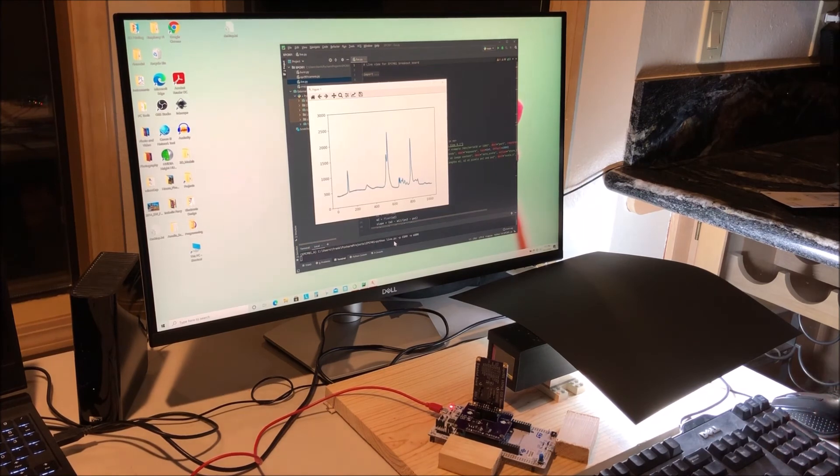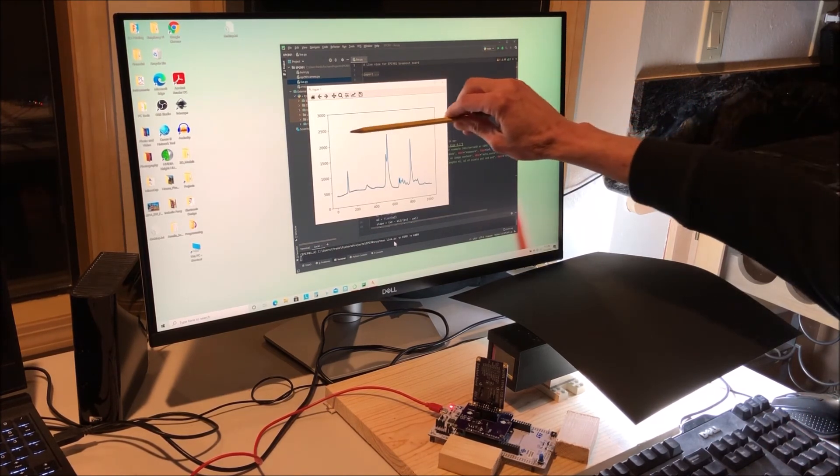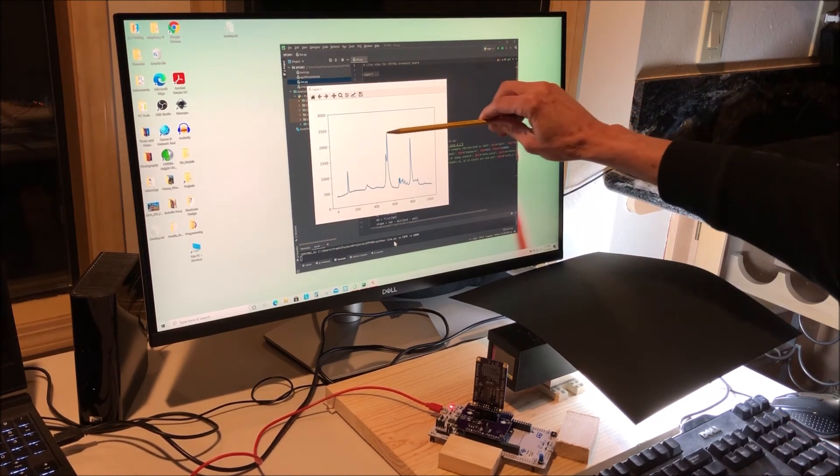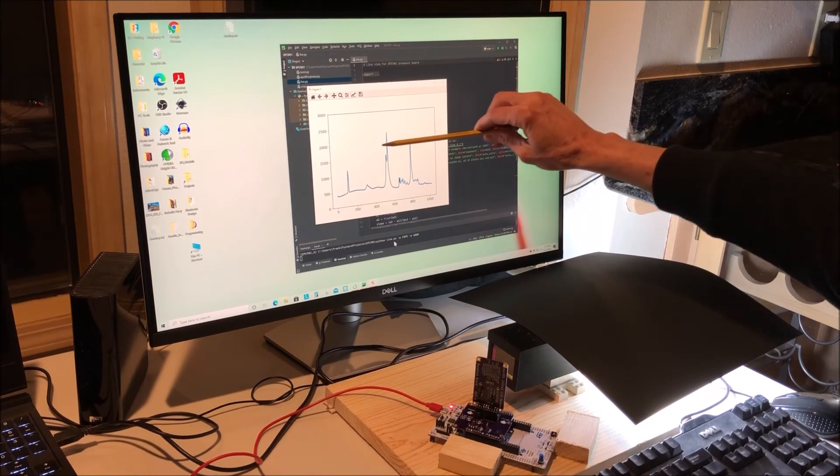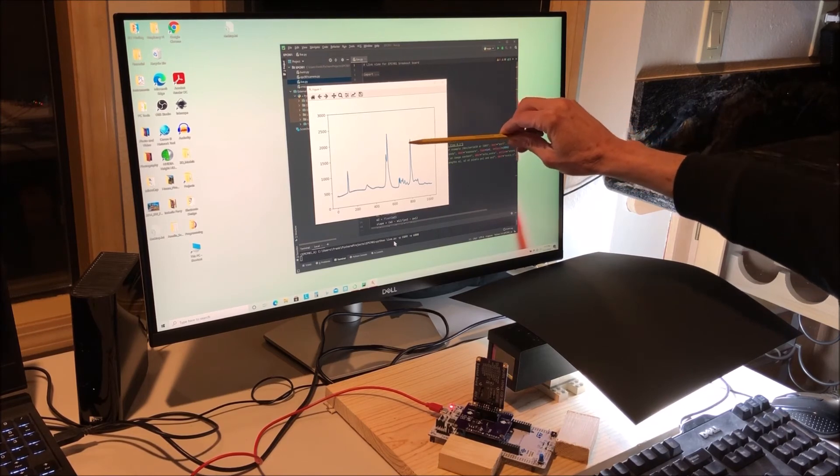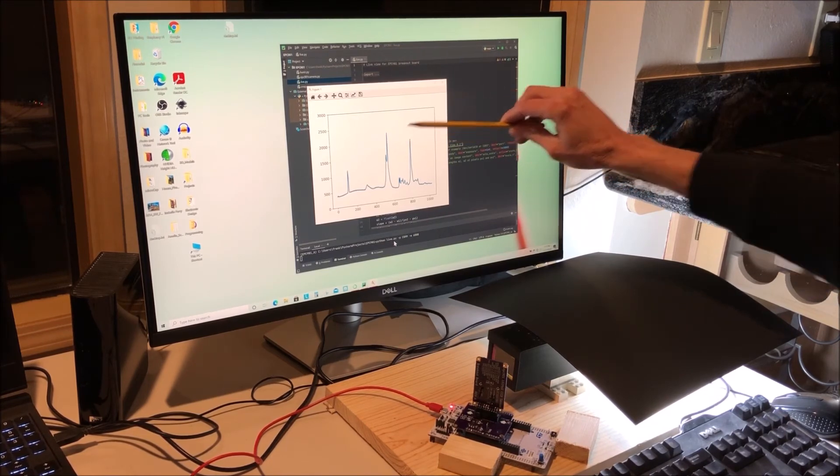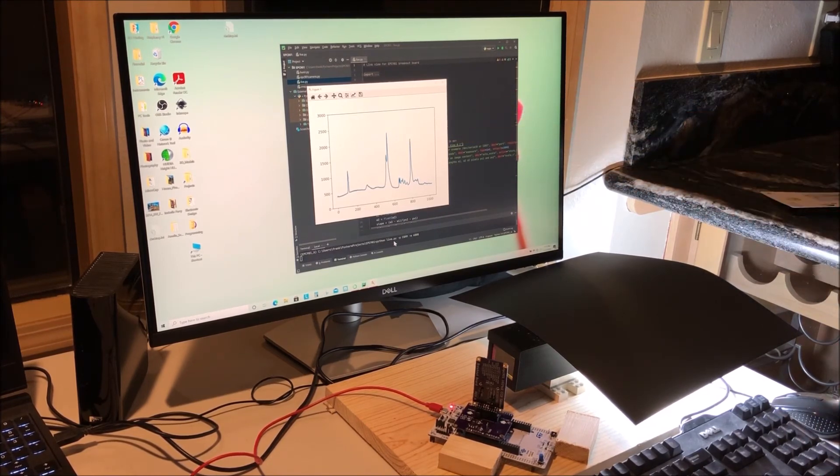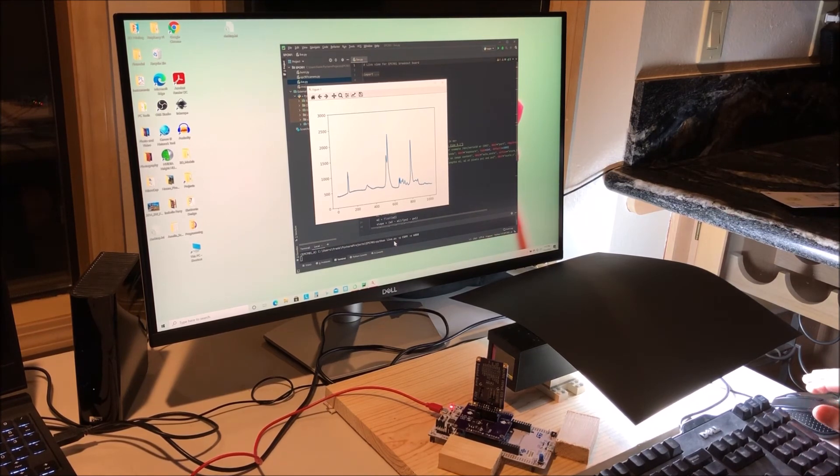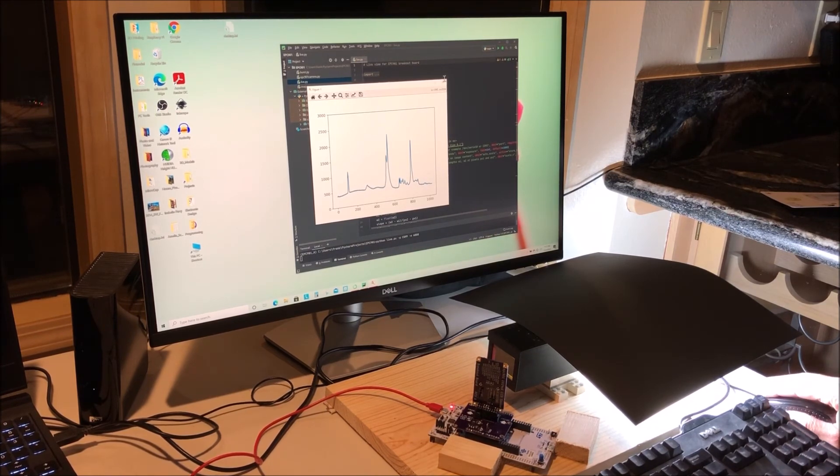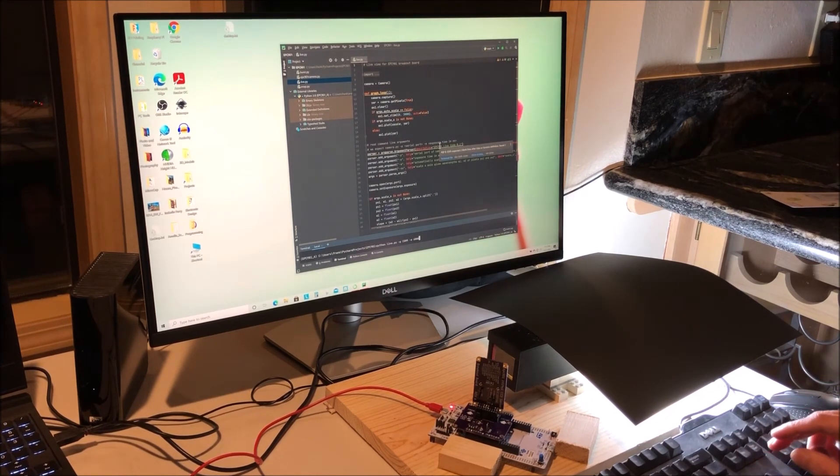All right. We're just below 2500 there. It's pretty close but not clipping at the moment. So I might even bump it down a little bit more here. Let's go to 5000.